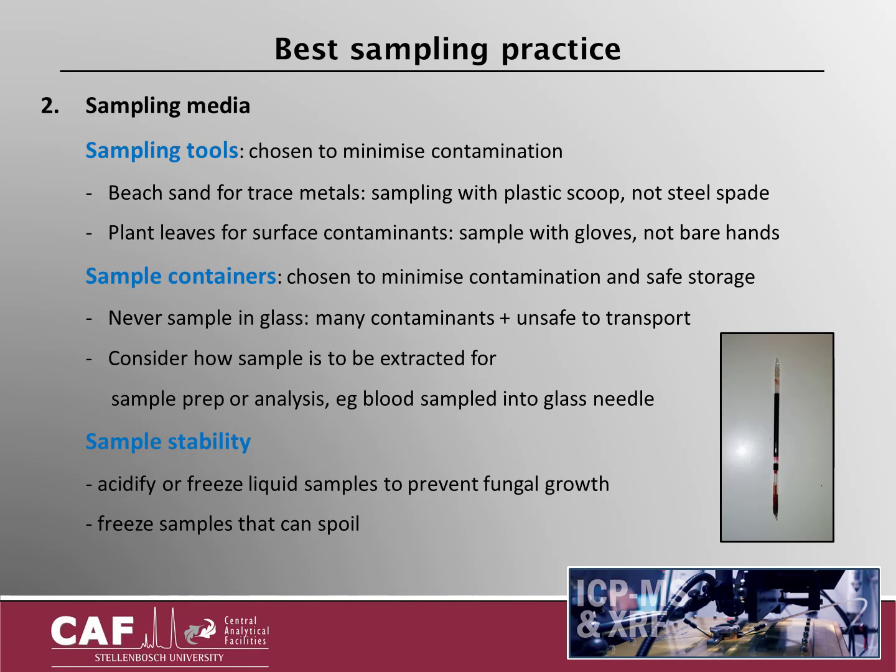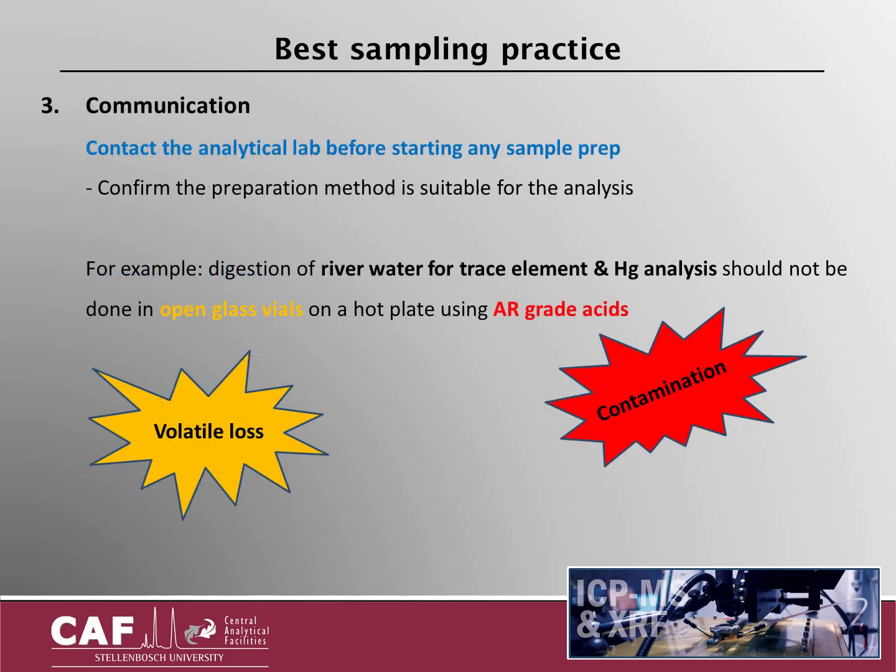Any liquid samples you might need to acidify or freeze to prevent any fungal growth, and other samples that can spoil, first freeze them before you process them further. Then last but not least is communication.